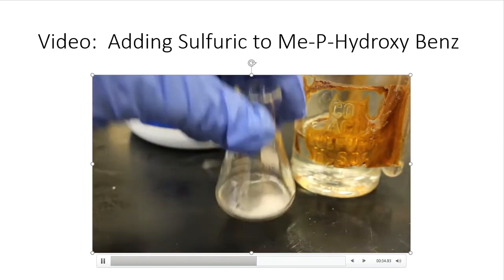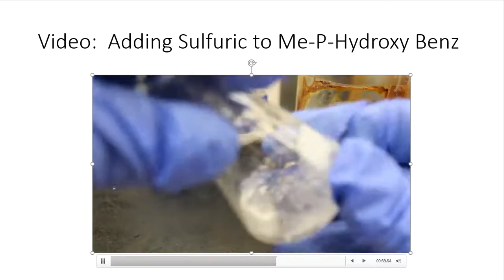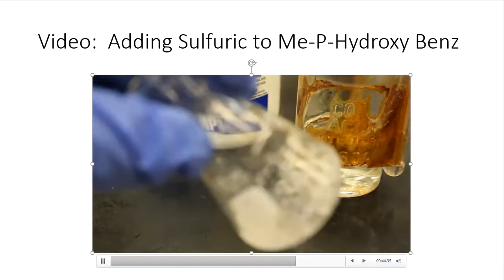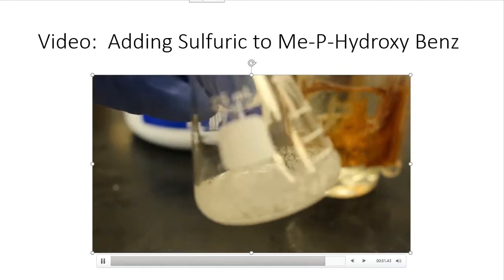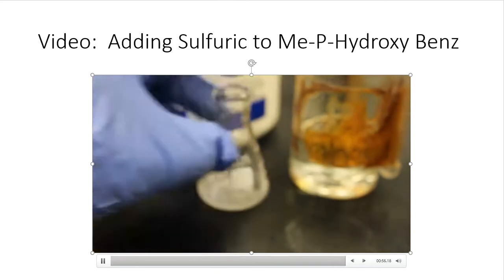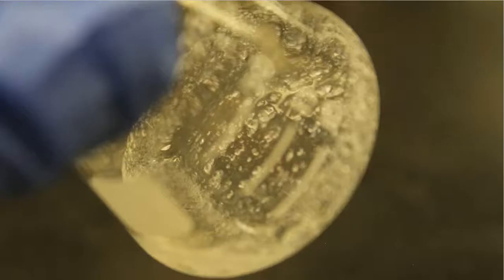So that was the addition of the sulfuric, and I'm getting ready to swish. And there you go. Did it dissolve? I don't think so. Okay, so the close-up picture of that one, folks, this is what we've got. Again, I'm not very happy. It didn't fully dissolve. The lab directions tell me make sure it dissolves before we go further.